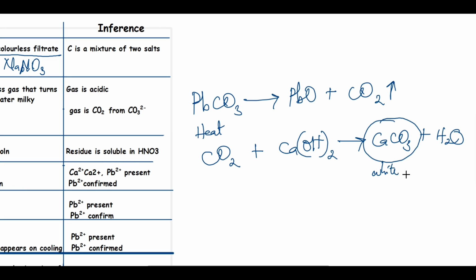Okay, that milkish kind of precipitate you see in the lime water is as a result of the formation of calcium carbonate. So that's just a quick one. All right, so here's the video and the explanation for that.